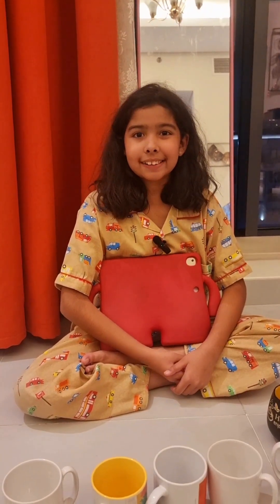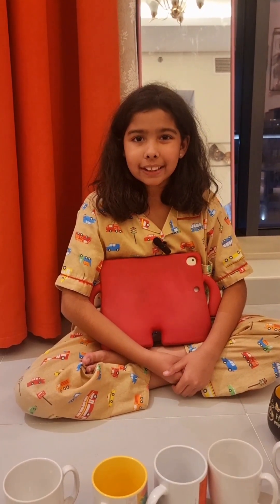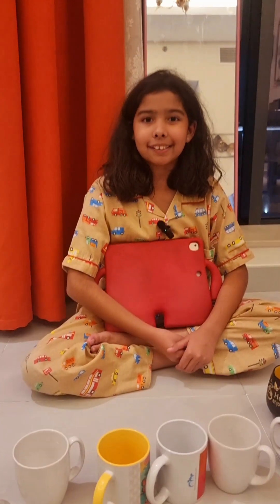Hi guys, what's up? It's Isha and today we'll be doing an experiment. So today we'll be looking at different brands of water and measuring their TDS.